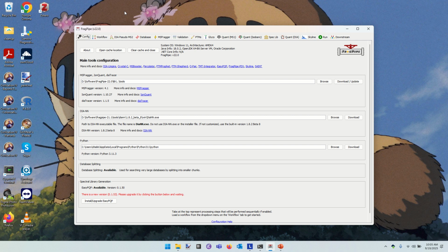the demonstration and do two really different takes on what proteomics is between the morning session and the afternoon session. This morning we're going to be talking about what I consider the bread and butter of proteomics. I have a bunch of replicates of type A, a bunch of replicates of type B, and I want to know what's different between them. What's going to be a little unusual about this is that we have data from what's called a DDA style experiment and a DIA experiment.